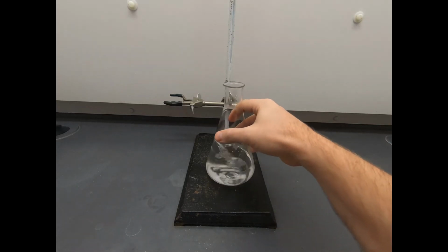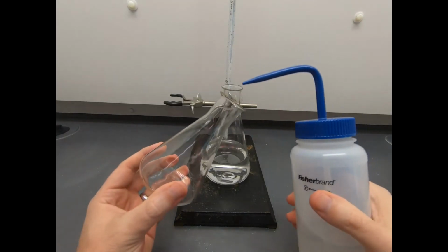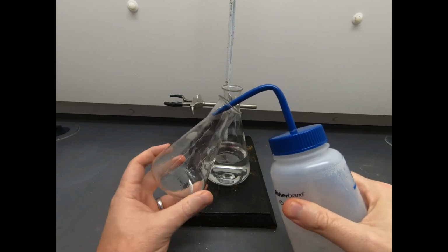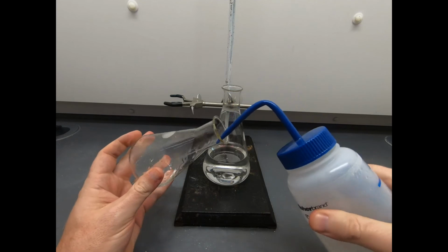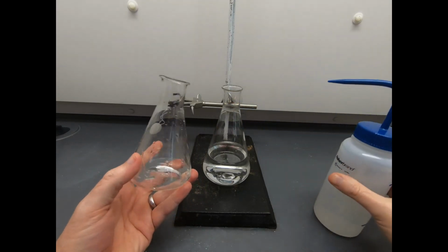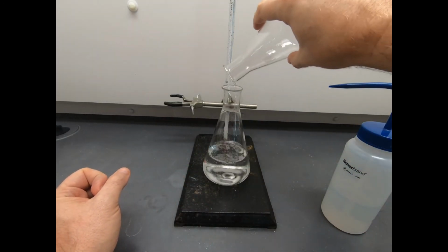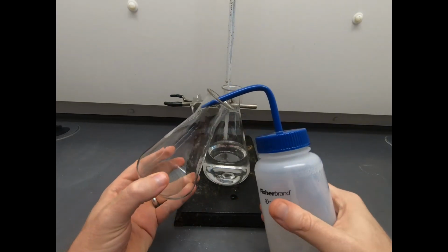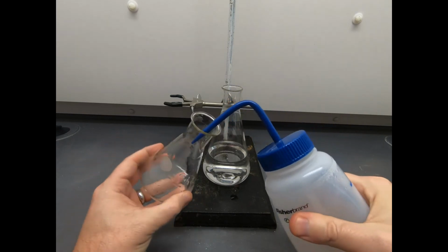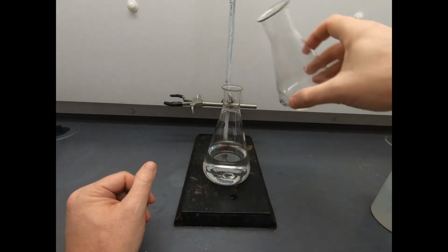And here we go. We'll swirl this around a little bit. And if you notice, there's a problem. We don't have any precipitate. Well, we're going to need to let this cool down. So let's rinse this with water. Now I was so careful about not adding any more isopropanol than we needed. I'm not going to be careful with adding water. We're fine. We can use as much water as we want because aspirin has a low solubility in water. And it's nice not to have to worry about amounts. Just squirt to your heart's content.